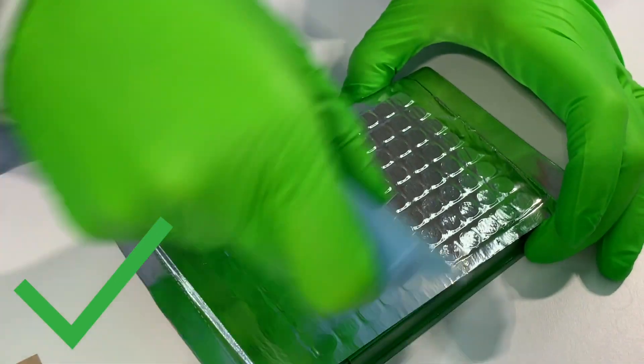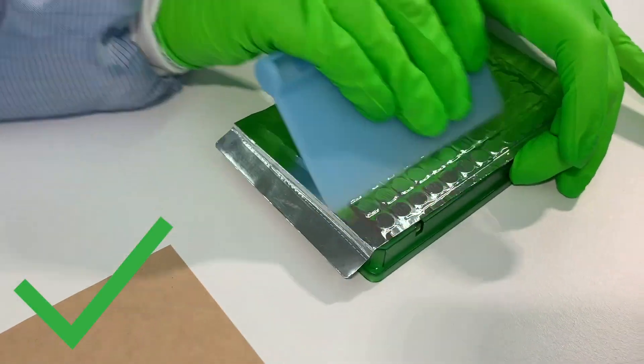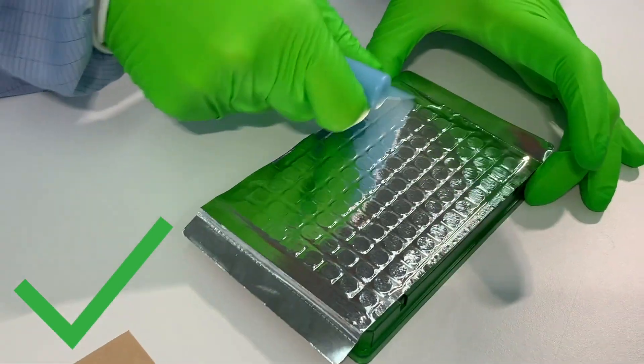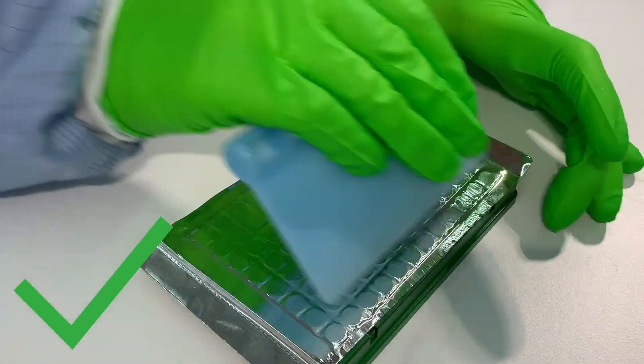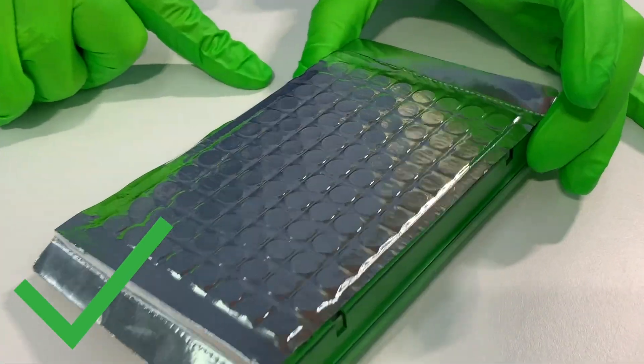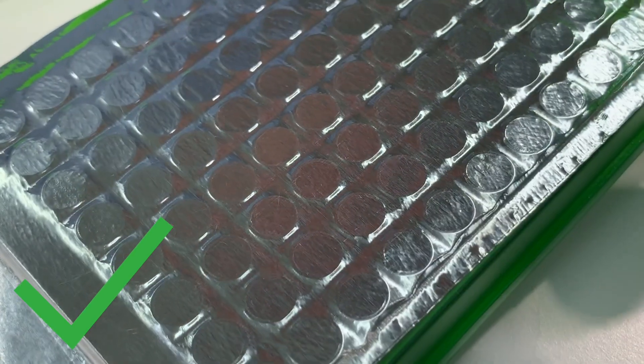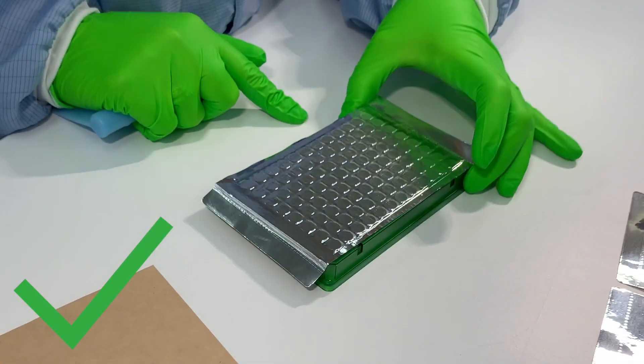Then ensure that the edge rows and columns are sealed properly by pulling the sealer over those rows specifically. You should see clear round marks for every individual well. If you're unsure of the sealing, pull the sealer again over the plate.